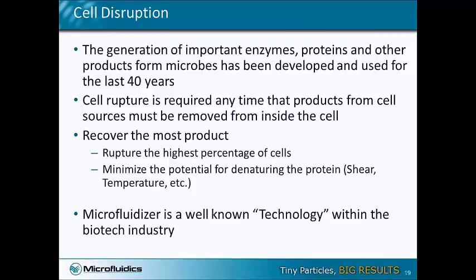And anytime you need to harvest the product from inside the cell, you need to rupture the cell wall so the product inside the cell can be released.